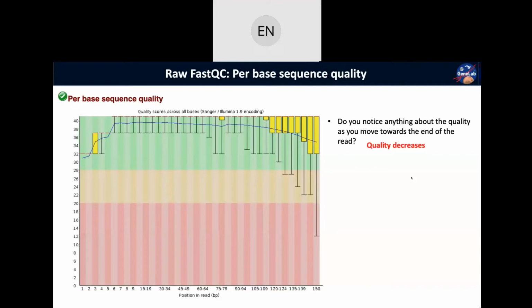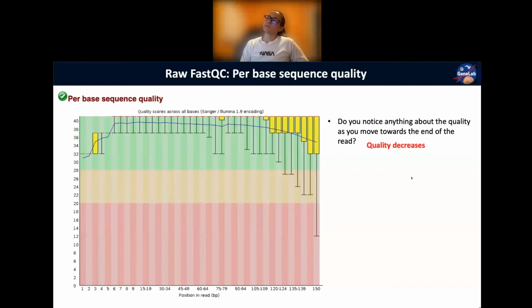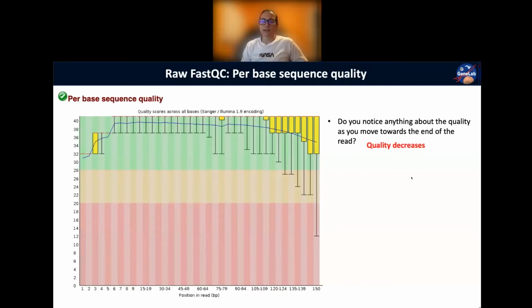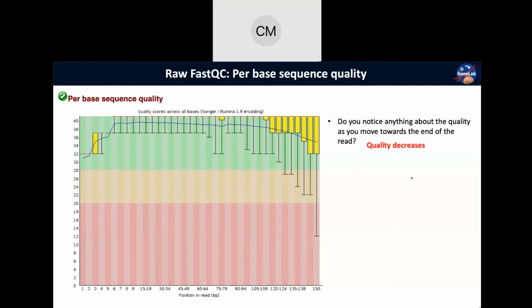Part of it, it could be the reason. Could it be actually on the side of the machine? Maybe as it's going along, you lose integrity of its read, kind of like probability. It loses its integrity over time. So it's actually on the machine side of things. I don't know if that's anything close to being correct.